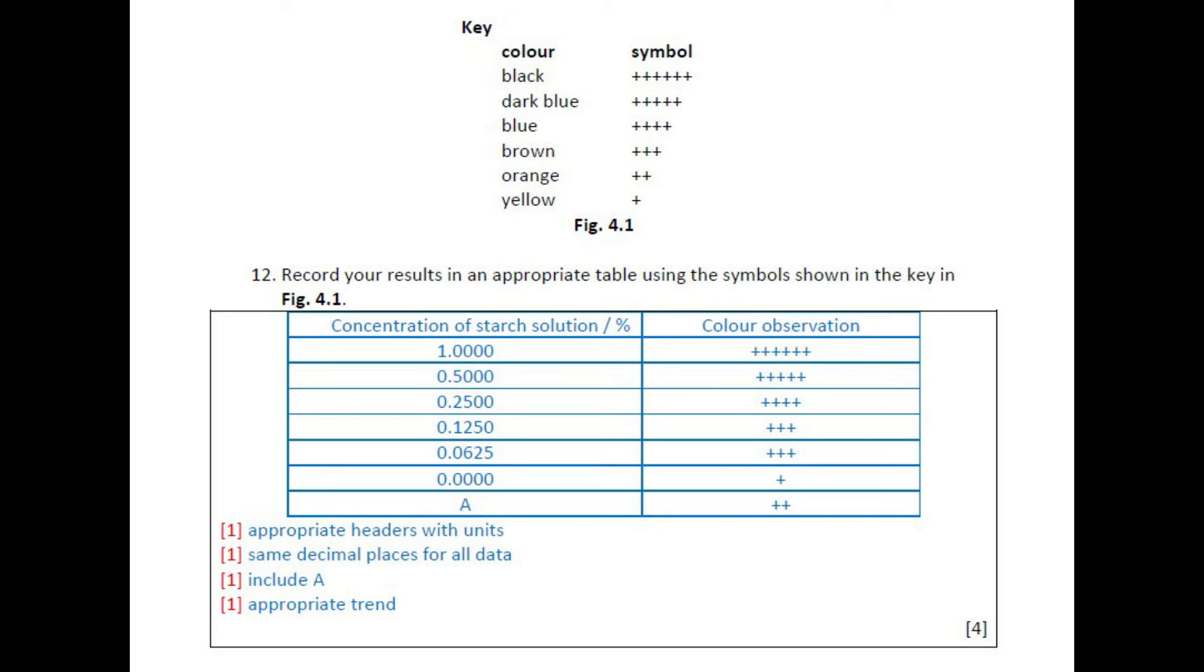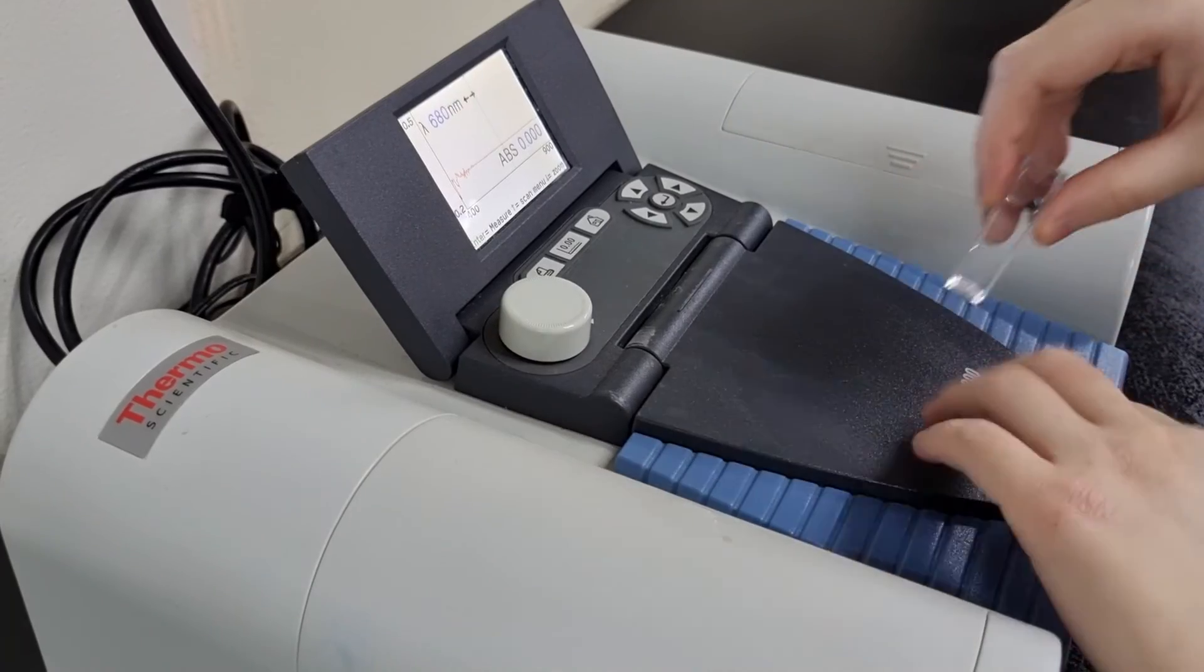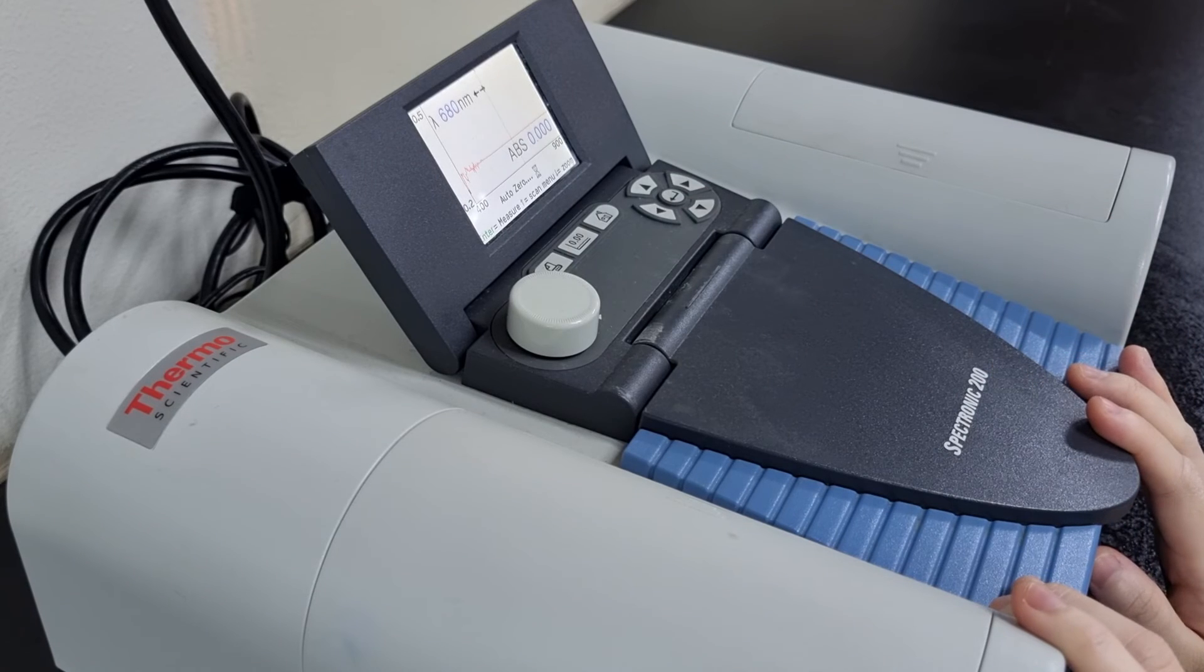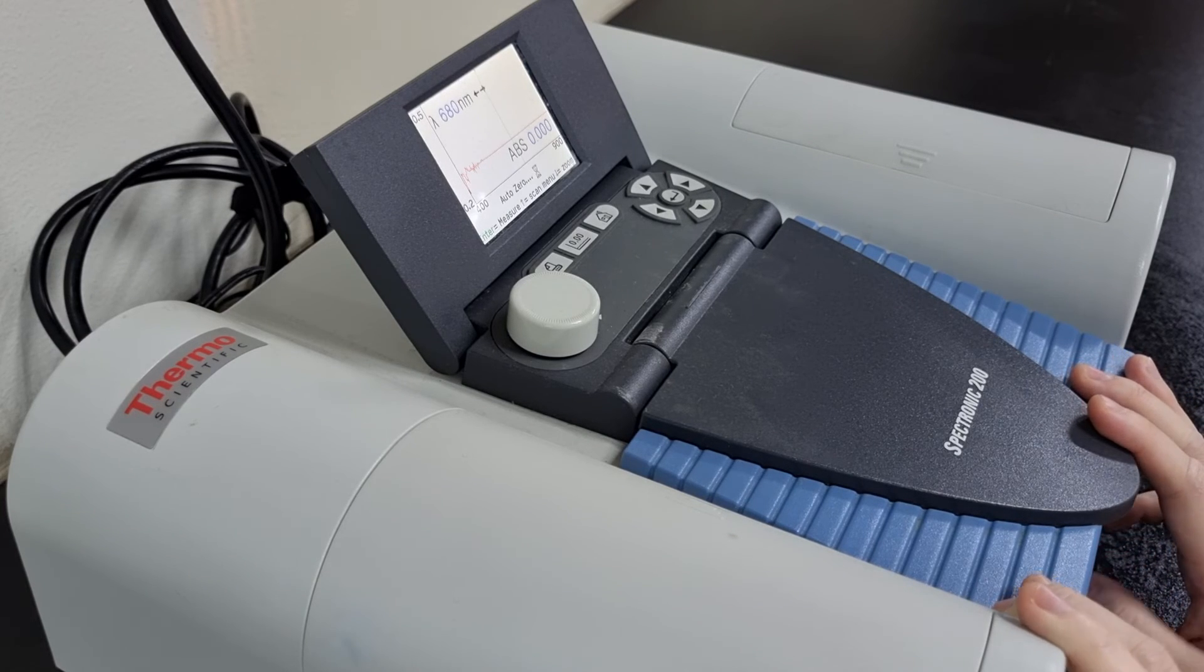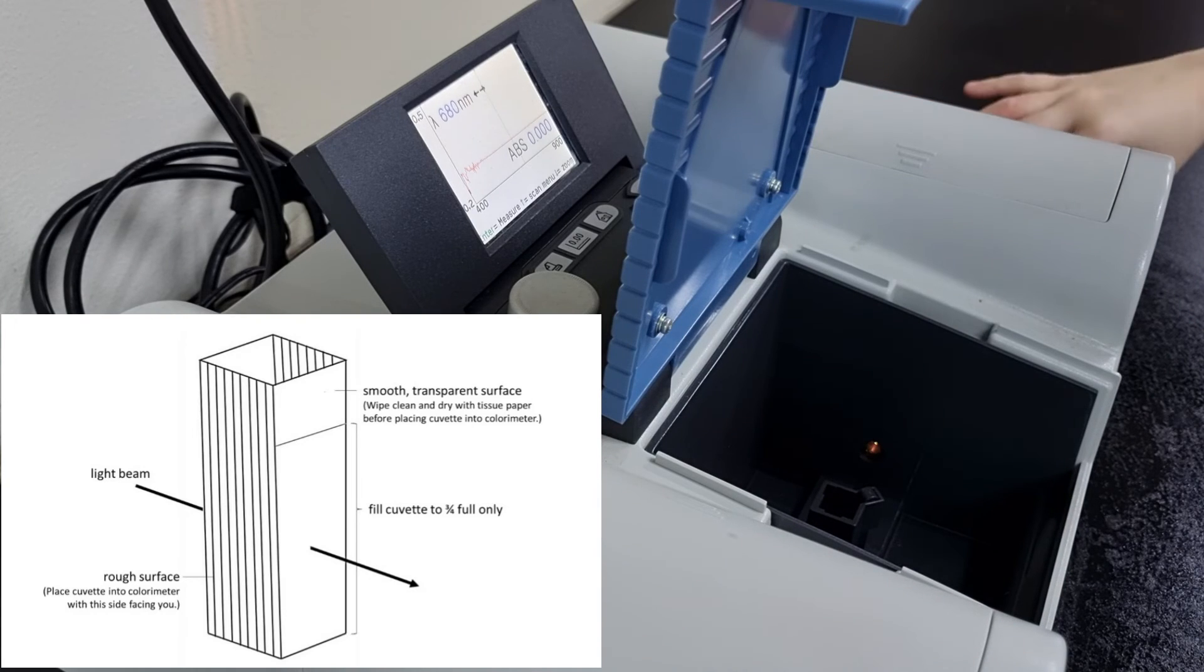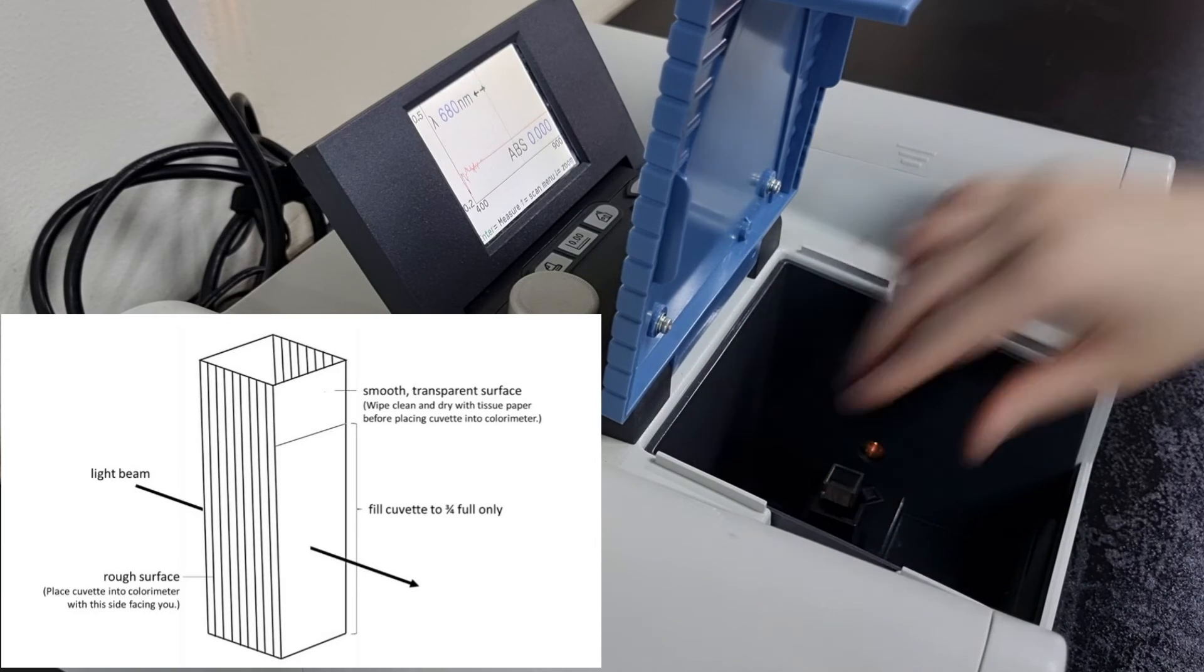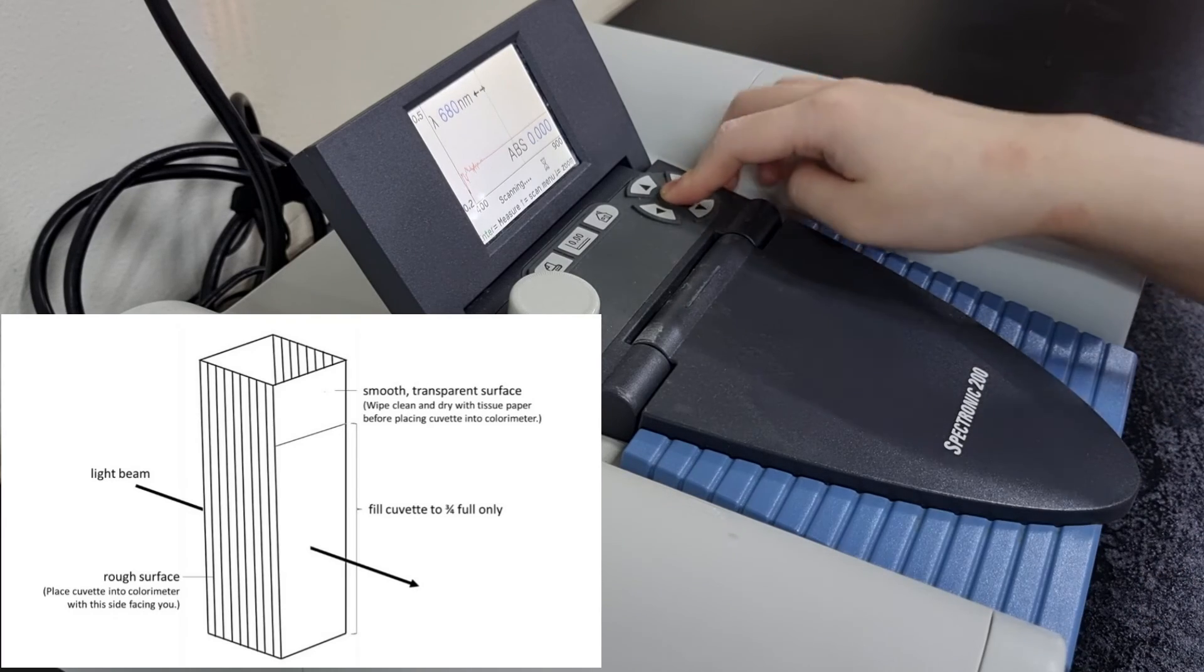Now moving on to our quantitative test. While using the spectrophotometer, it's important to first zero the machine with a blank cuvette. This is just a cuvette with distilled water without iodine. After that, we can then put in the cuvette with our solutions in order to measure the absorbance. The machine shines a light beam through the smooth areas of the cuvette, so the rough surface should be facing you. And then you can press enter, and the absorbance reading will be shown on the screen.